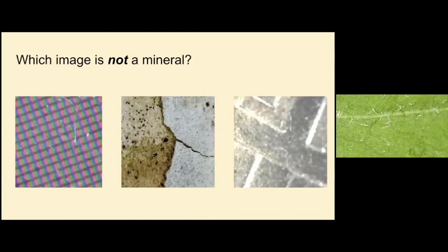The first one kind of looks like a rug. A rug. So that's not a plant, it's an animal. Rainbow, since you can see colors. Fern, what do you think? The first one that's not.